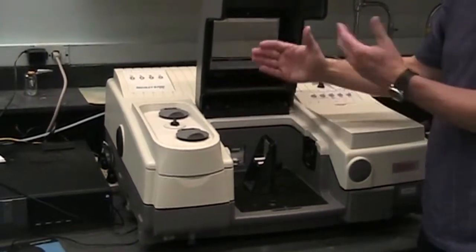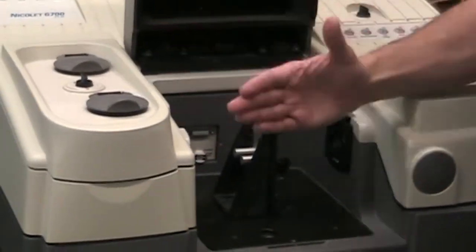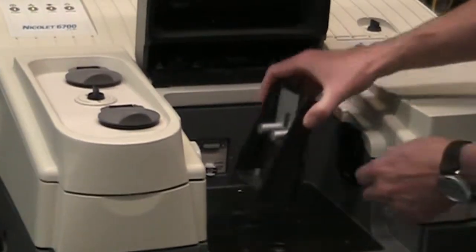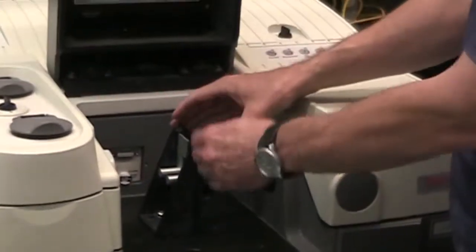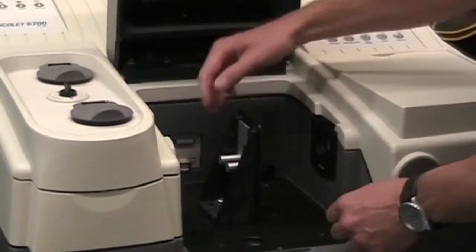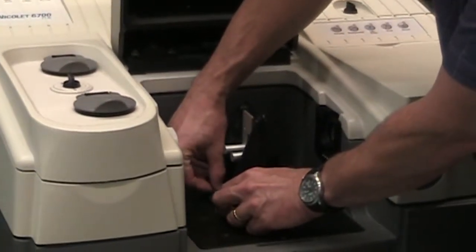It'll align it properly with the screws in terms of front to back of the spectrometer. You have a little bit of leeway here because of this channel. The main thing is you want the sample to be about halfway in the middle. So I'm just sort of eyeballing it, getting the screws started.